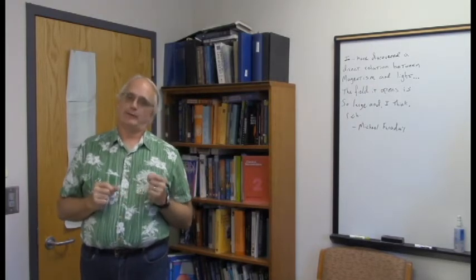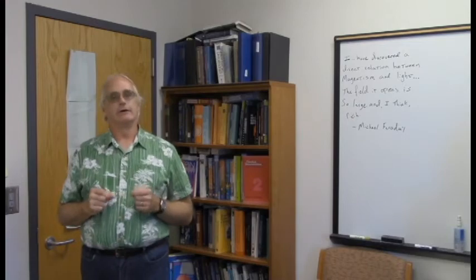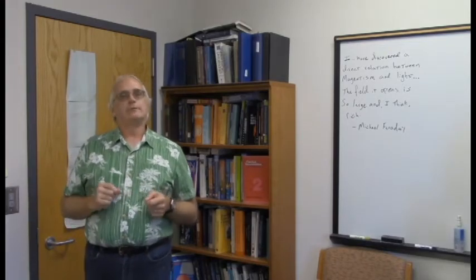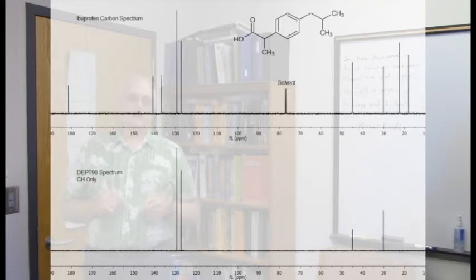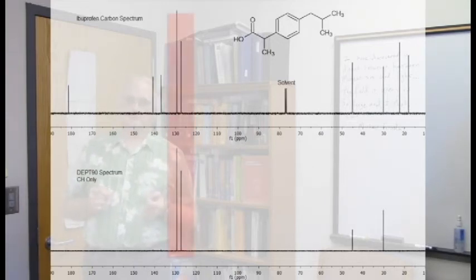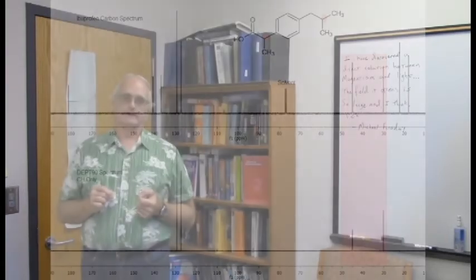And sure enough, that's what explained what was going on in my carbon spectrum. Here's the carbon spectrum and the DEPT 90, remember DEPT 90 will show you carbons with one proton attached and all other carbons should be suppressed, either truncated or gone completely. And sure enough, we see exactly what we would expect to see from ibuprofen. We see the aromatic CH groups showing up very beautifully and the two aliphatic CH groups also showing up very clearly.